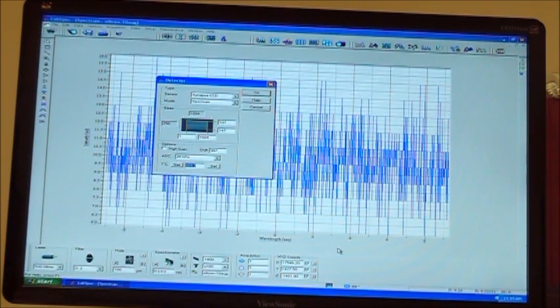As your detector gets really old, you might find, 10 years from now, it might stop at minus 60. It's still good, you can still use it. But you want to make sure the detector is fully cooled and is stabilized at that point before you use it. Because otherwise, as the detector cools more, you'll see your background and signal go down or up, depending on what you're looking at.